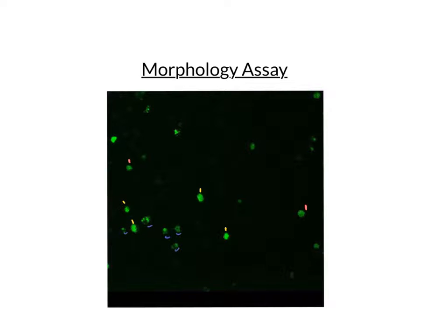apoptosis cycle, with their DNA condensing and maybe even some fragmenting of their DNA. There are also fragments, labeled in blue, of cells that have completed the apoptosis cycle and are floating in the medium as fragments, waiting for a macrophage to come and eat them up.